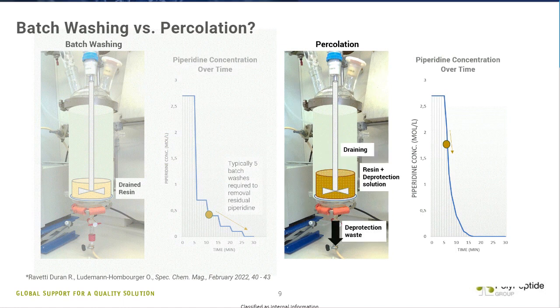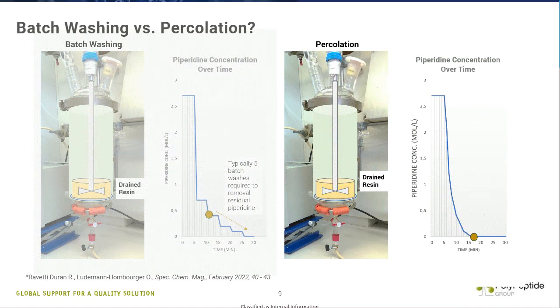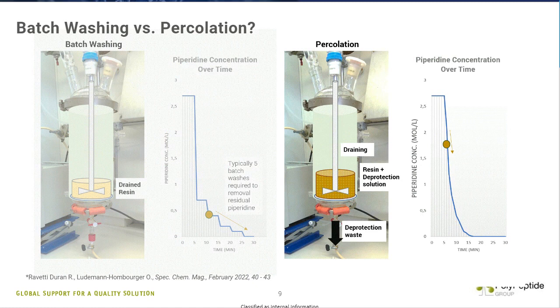Next one. Did you try to identify the impurities in the final product, and how was it done, by synthesis or MS data? This was for a phase 1 campaign, so not all the impurities had to be identified for the need of the client, of course. As a chemist on the project, I'm always very interested to identify the impurities because it makes our job easier in the end.